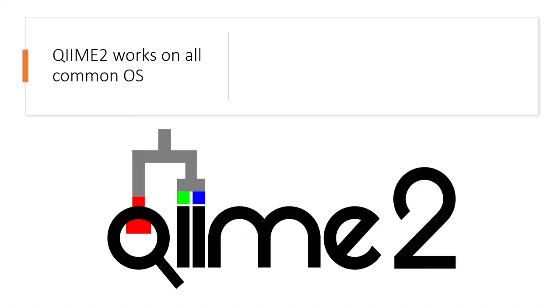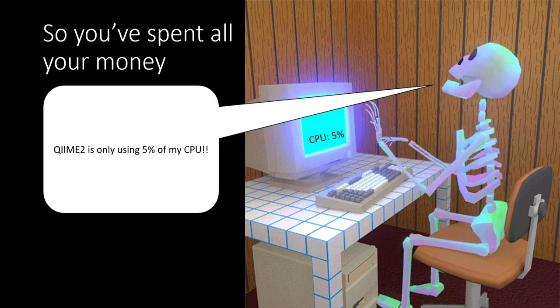Fortunately for us, QIIME2 works on all common operating systems. All we'll need to do is a native conda installation, which is pretty straightforward for most systems. Or you can use VirtualBox, which might be good for testing things out, but can limit your computational abilities. So I probably wouldn't recommend VirtualBox as a thing right now, but it is better than having to restart your computer each time to use QIIME.